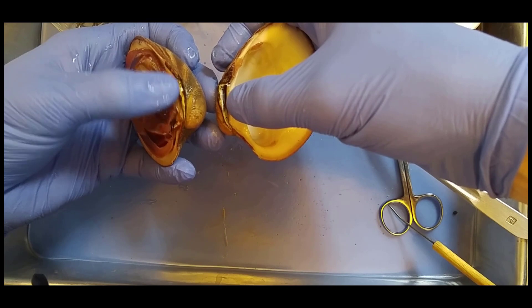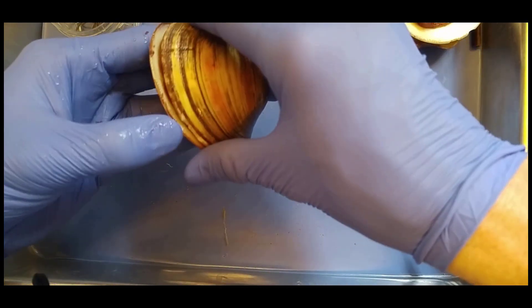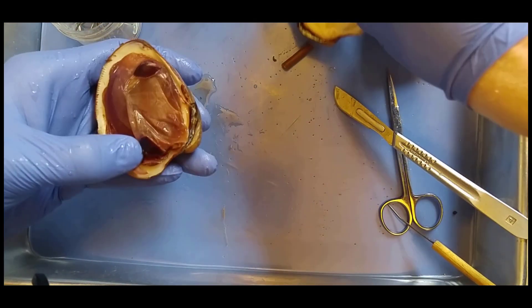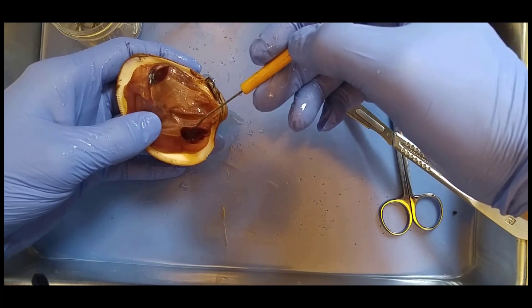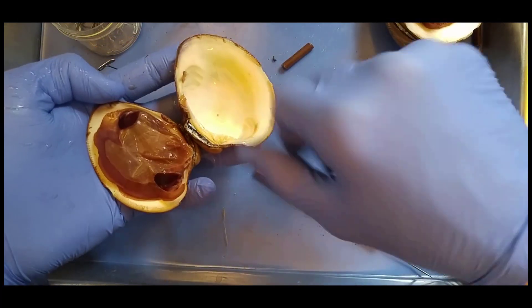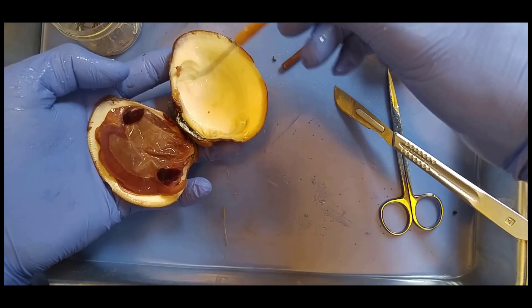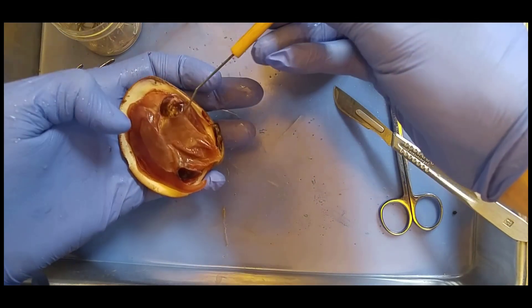So right here we have the hinge ligament. And remember this will open the shell when the adductor muscles relax. These right here are the adductor muscles. And you can see on the other side you can see the scars where they attach to the shell. So these are what contract — they're very, very large muscles.